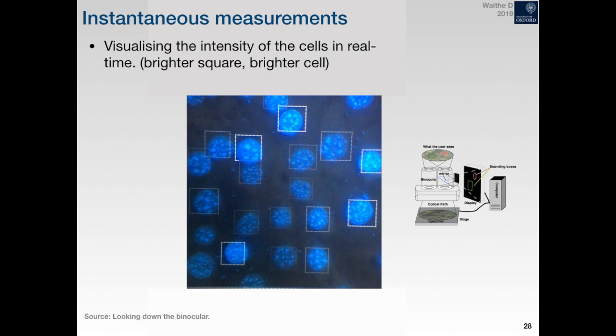Yeah, you had a question. How does the performance of your deep learning scale with magnification? So if you withdrew, that would give you a much worse pixel definition. Yeah.